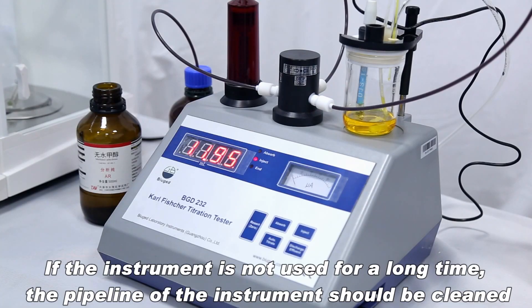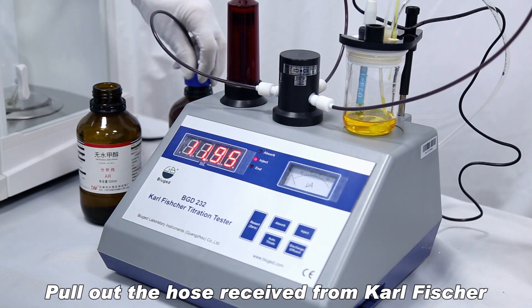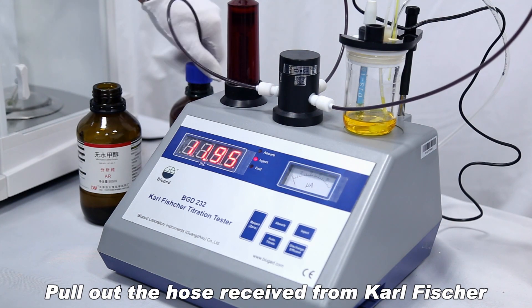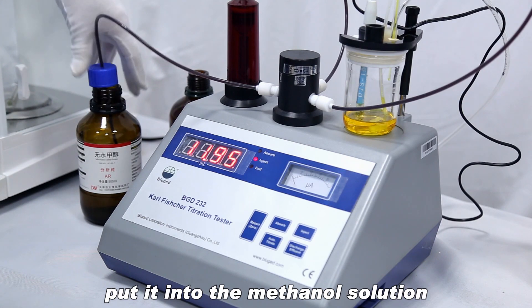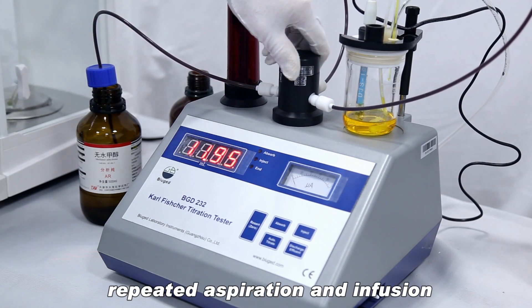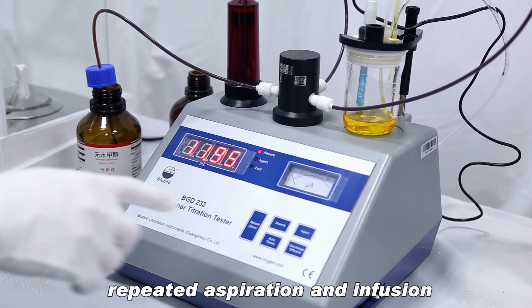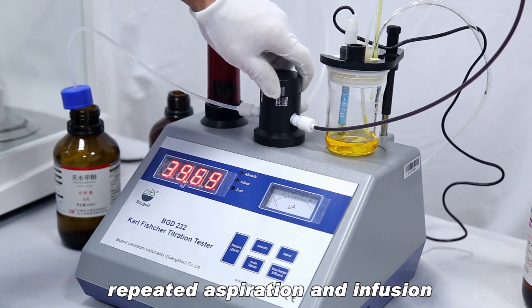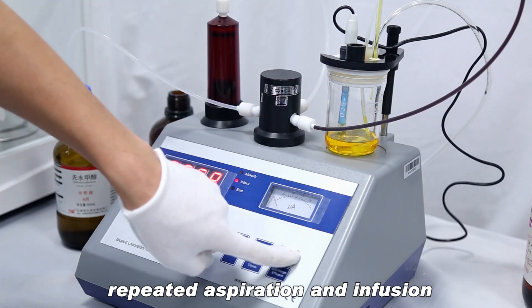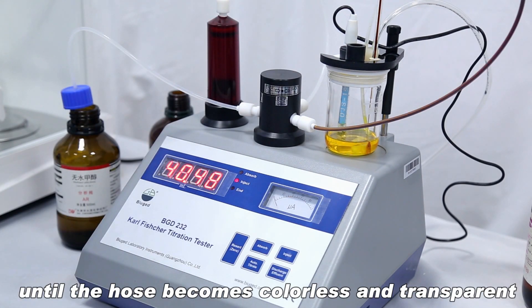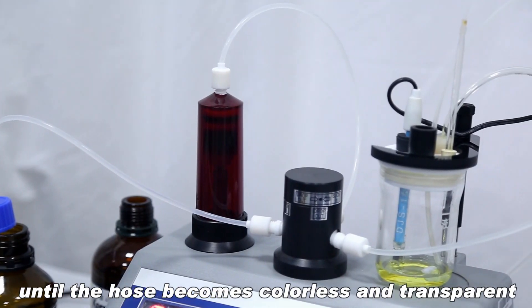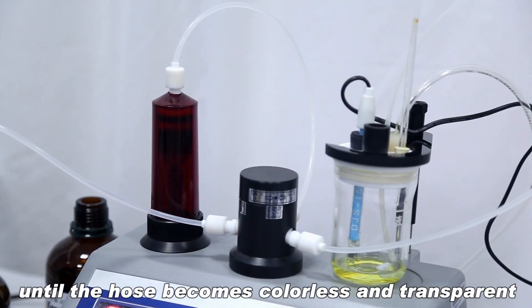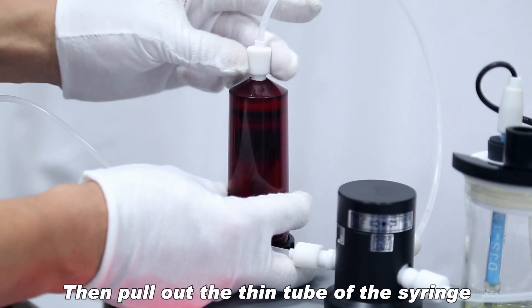If the instrument is not used for long time, the pipeline of the instrument should be cleaned. Pull out the hose received from Karl Fischer. Put it into the methanol solution. Repeated aspiration and infusion until the hose becomes colorless and transparent. Then pull out the thin tube of the syringe.